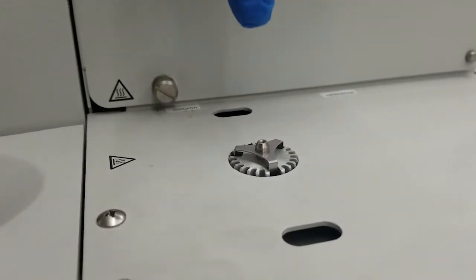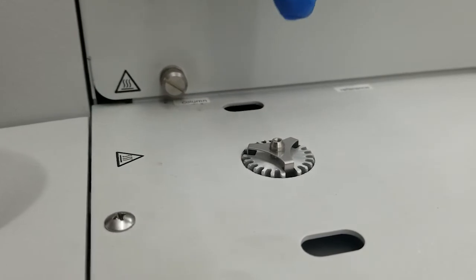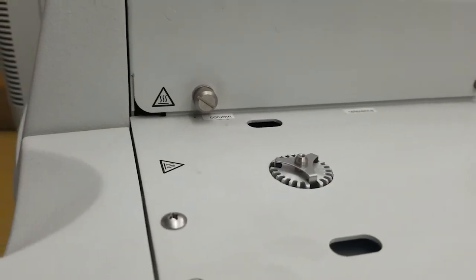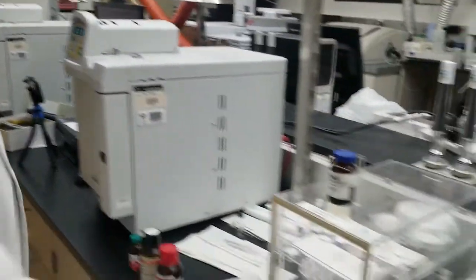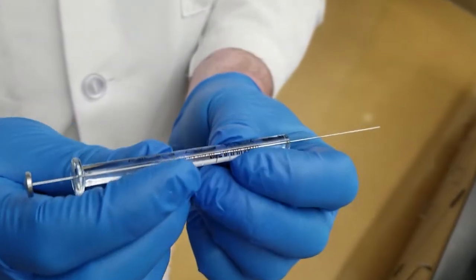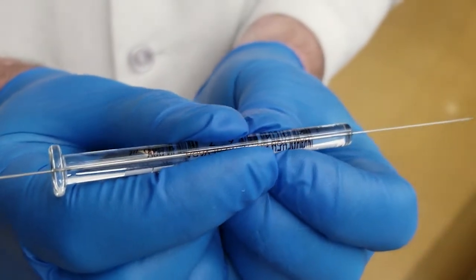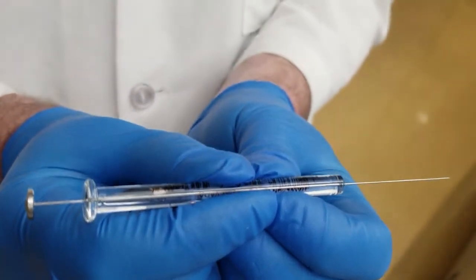So you're going to see when I inject on the actual live instrument that I'm going to put the syringe needle all the way down until this toggles down, and then I'm going to tap the top of the syringe to inject the sample. These machines are so sensitive that we actually have to use a very small syringe that could deliver up to 10 microliters, but we only need to inject about 0.1 to 0.2 microliters because too much will saturate the detector.